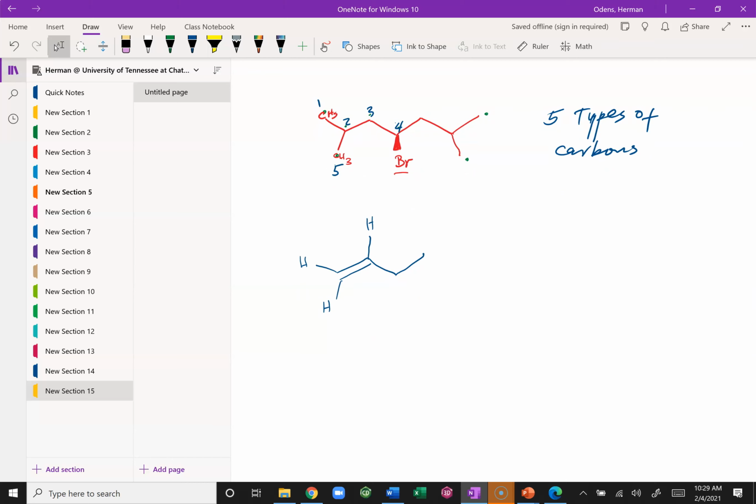Double bonds are tricky because, for example, if you have a double bond, like in this case it is geminal, for the signal for this proton, you count its neighbors and add +1, but then this other one is going to take all of those signals and split them in half. So you're going to have more peaks. That is an effect that the double bond has.